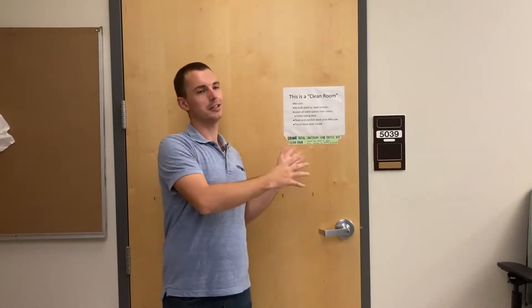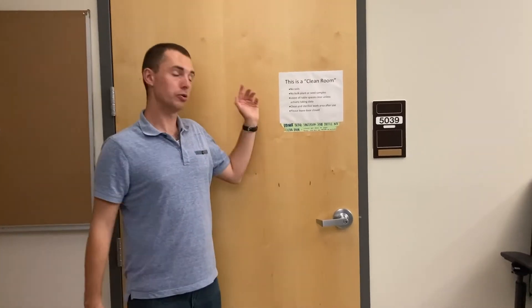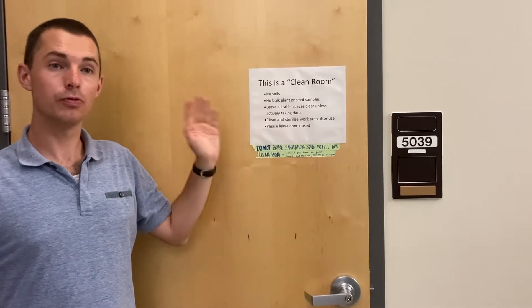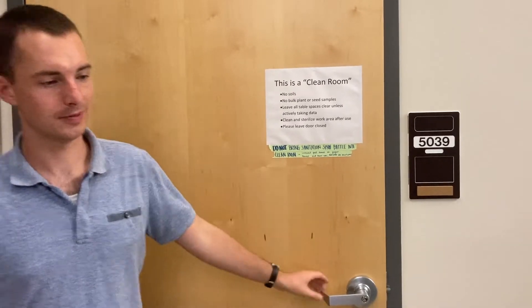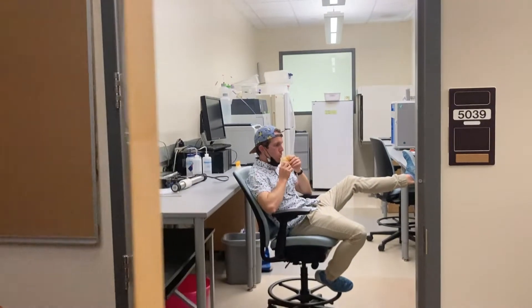Just opposite of the dish room is our clean room. This is where we keep some of our analyzers and do a lot of our data analysis. It's called a clean room for a reason — we don't want to contaminate it with outside things. So no soils, no bulk plants or seed samples, no food or water, not a lot of personal items. We want to keep it sterilized. It's especially important to wear long pants and closed-toed shoes in here.